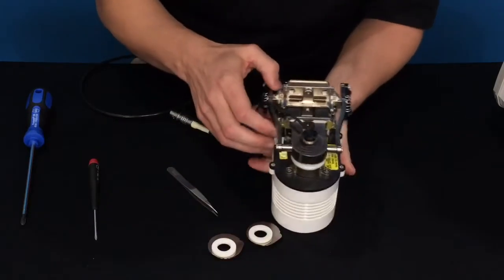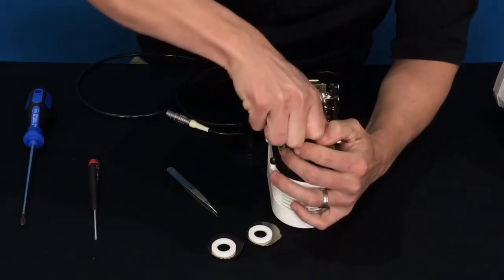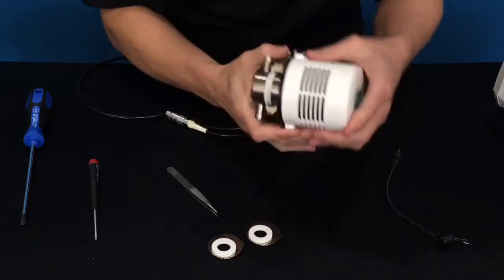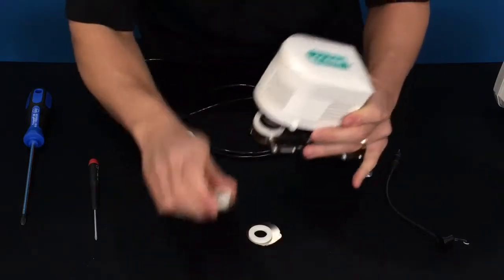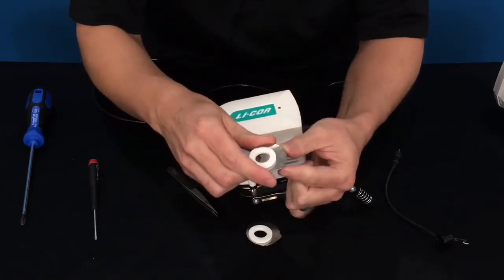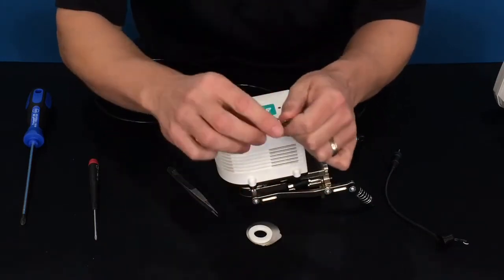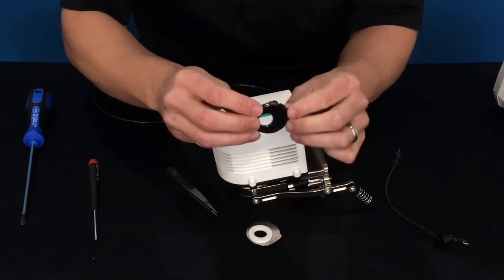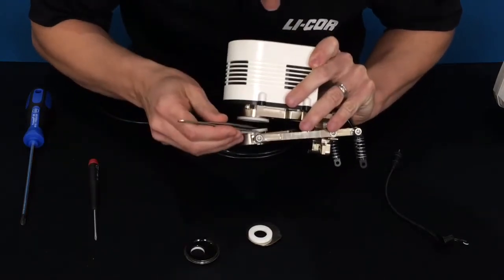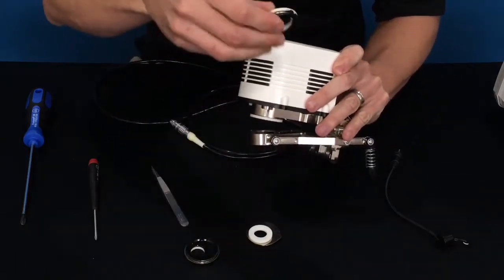First, remove the thermocouple, which can be gently pulled out from the bottom, being careful not to bang it on the side of the walls. Put the thermocouple to the side. Then we will remove the apertures. There's a notch that has to go in a specific location, and there's a little bit of room to grab it once it's installed. It is held in place by an o-ring underneath. Use tweezers or a finger to get underneath that notch, and it will pop right up and slide right off.